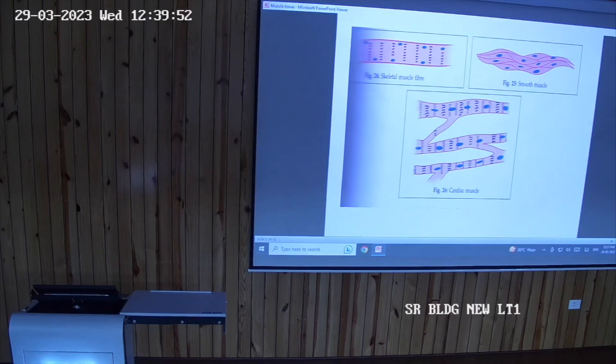Cardiac muscle fibers, no doubt, are elongated muscle fibers, but the length is shorter compared to skeletal muscle fibers. It is necessary to use the word comparison, otherwise shortened to what? So your answer should be complete. The number of nuclei in each muscle fiber is 1 or 2, present in the center.